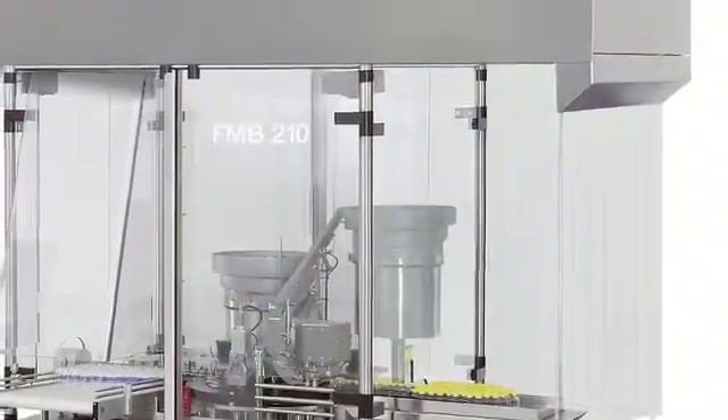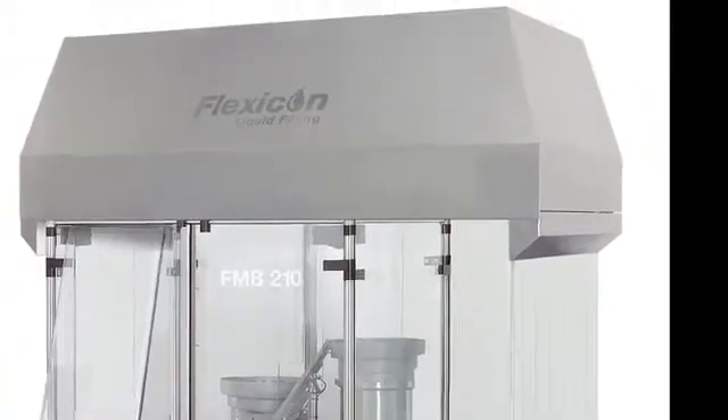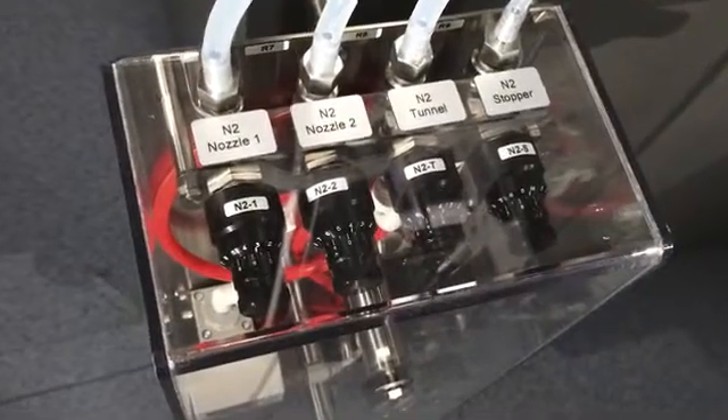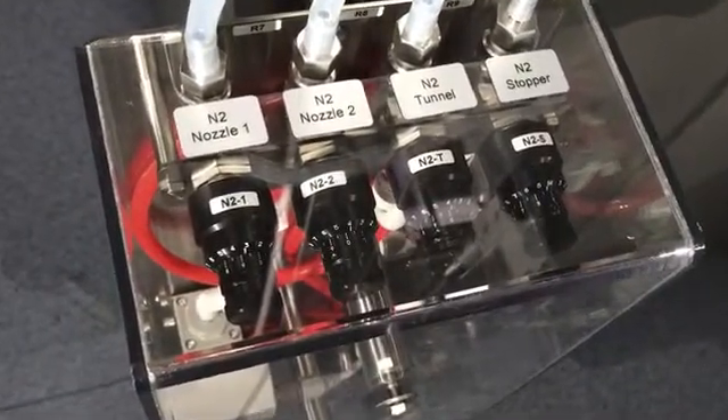The filling and capping line is very compact, configured using standard modules and proven technology. Optional modules include a laminar air flow unit which protects open vials from contamination, connection to a particle counter, and a gas purging system that minimises oxygen content in filled vials.